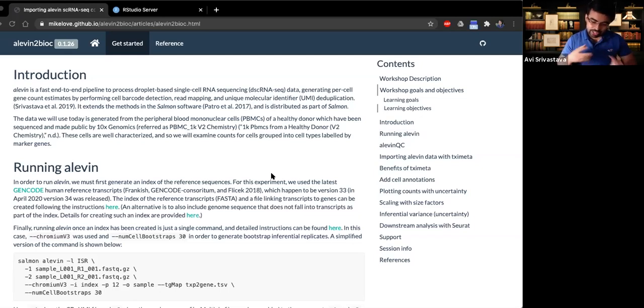So with this motivation, Alevin was designed to model this in a principled framework with one more thing in mind, that everything is one streamlined process. Before Alevin, you would combine multiple tools and then generate the gene count matrices. With Alevin, you just give it the FASTQ files, and it'll go through multiple processes like cellular barcode selection, UMI deduplication, and whitelisting of cells, along with mapping of reads to the reference, and it'll give you cell versus gene count matrices.